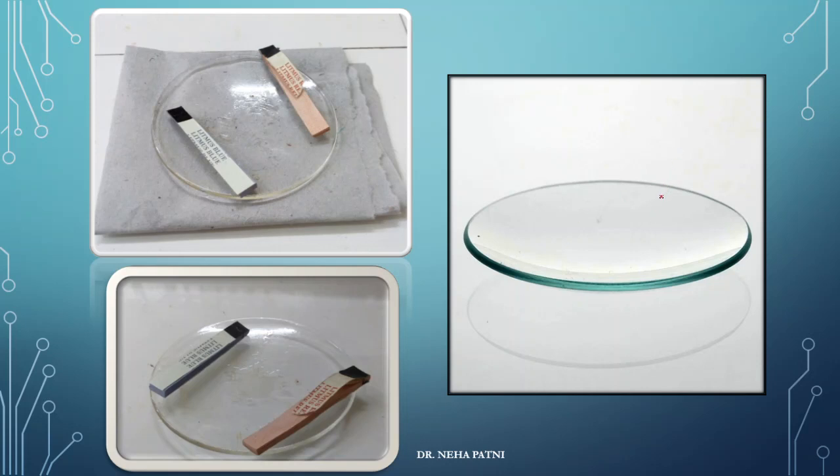In this picture, obviously this is a watch glass wherein you can keep your substance. Then this is litmus paper — red and blue litmus paper. Whenever you want to cross-check whether the solution is acidic or basic, you use litmus paper. If it is acidic and you add blue litmus paper to it, blue immediately changes to red, and vice versa for a base. These are litmus papers, and this is a filter paper, which is normally used to filter solid particles from a solution.